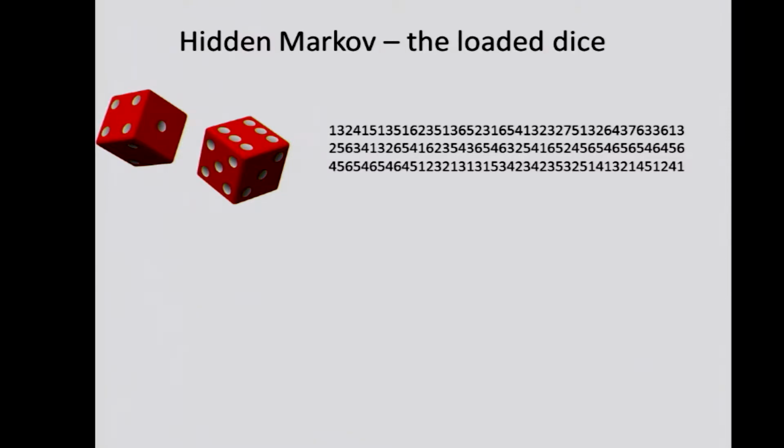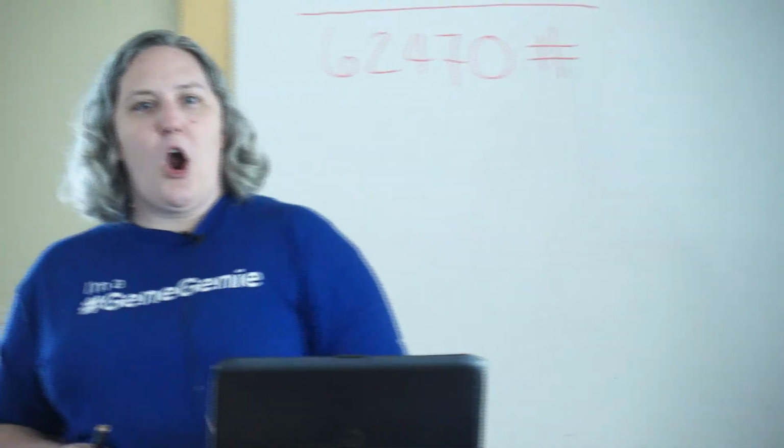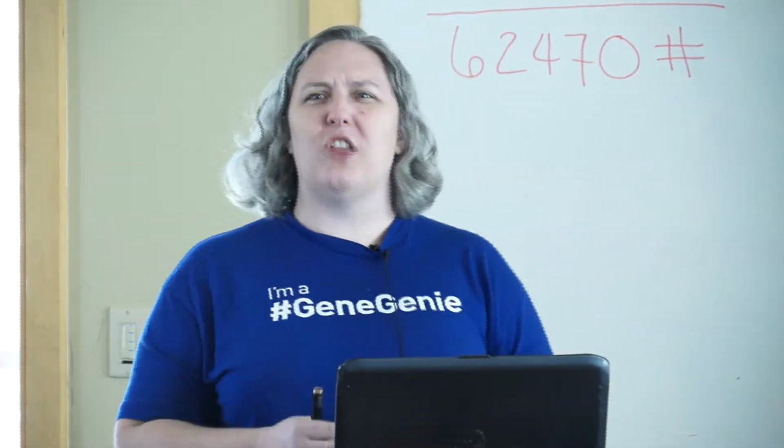Oxford relies on a 5-mer base calling, so there are 1,024 different states that can go through. So you've got AAAAA, you've got AAAAG. Those are 5-mers. Mark 1 has now moved to 6-mer base calling. They use a hidden Markov model to identify what those bases are. So they take all those samples, they figure what they are, and they say, the average of all these samples together, what does that look like?